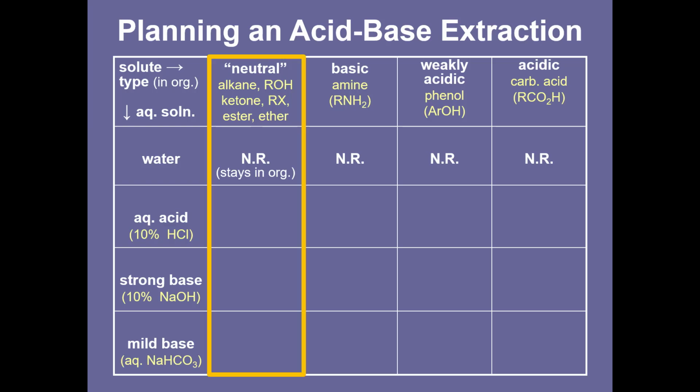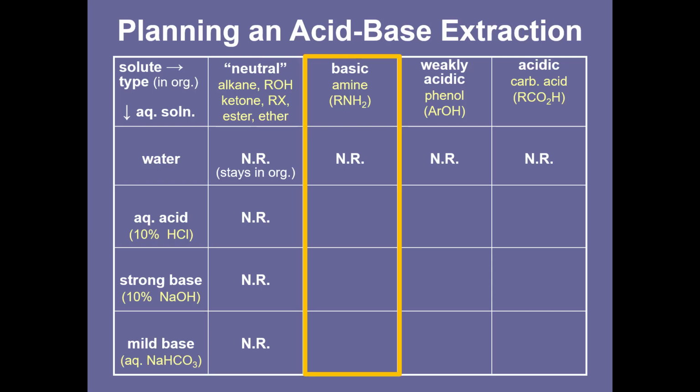The unreactive organic solutes are neither acidic nor basic. They have no reaction with any of the aqueous solutions shown, so we expect these solutes to remain mostly in the organic layer. Since amines are basic, they do not react with other bases.